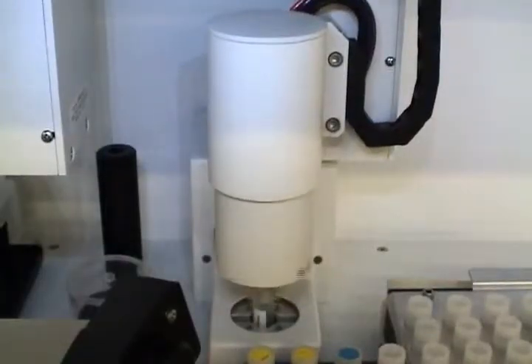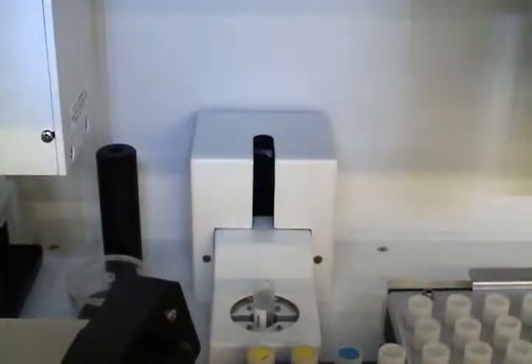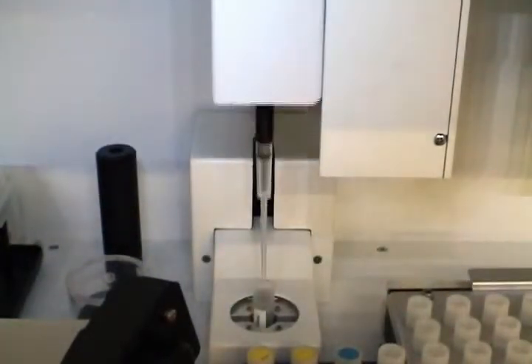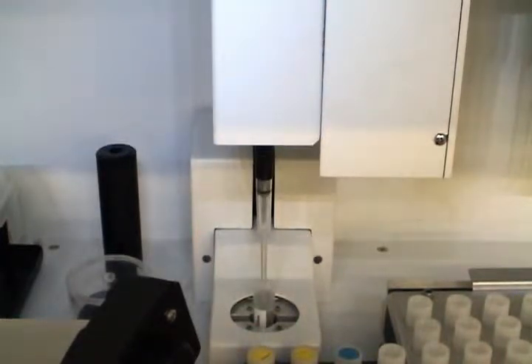The parameters allow setting a minimum acceptable meniscus error. There is no maximum error. If the meniscus reads an overvalue, it has to be a meniscus readout error, not a pipetting error. The meniscus detector is simply looking for insufficient volume on a pipetter aspiration.